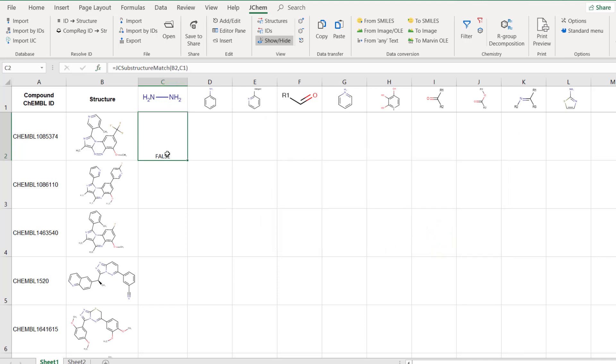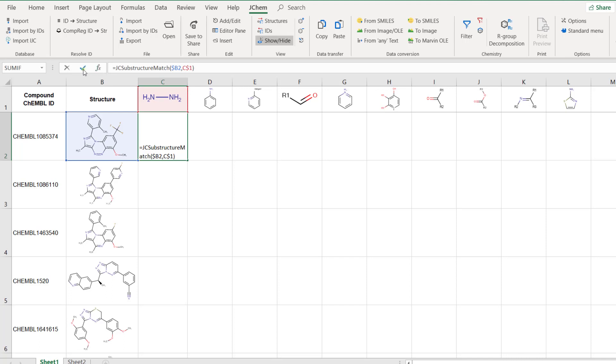But before copying it to adjacent cells, fix the column for the target and the row for the query by adding dollar signs to the formula. Now smart copy it to the remaining cells.